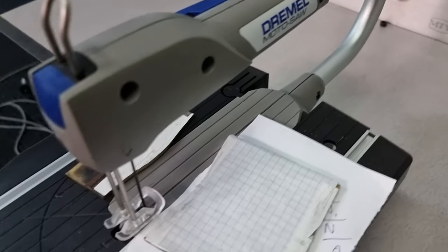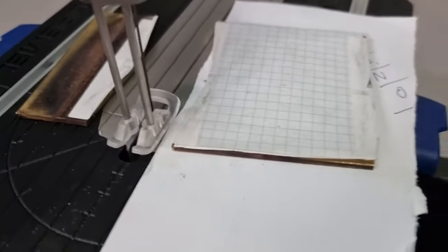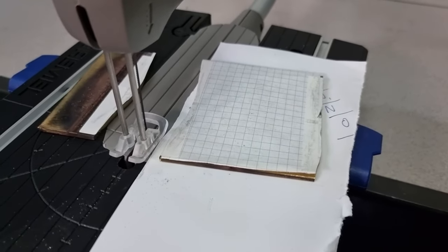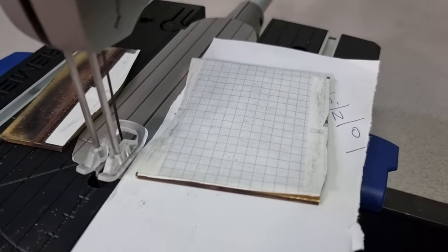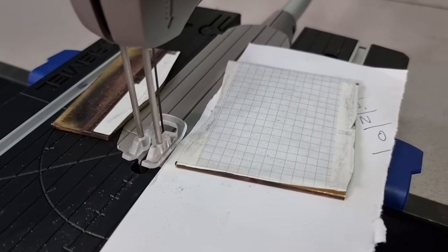Here is the motor saw set up and I have a vacuum cleaner attached to the dust port at the bottom and I managed to cut it. It took four blades, so there are a whole bunch of broken blades here, but it's done and I'm going to clean up the sample and that should be ready for the testing.